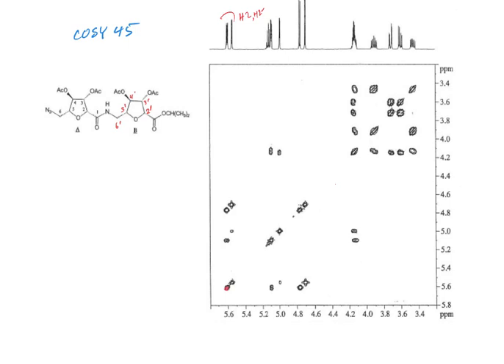Let's go from this most downfield one. Let's see here, what do we have? Oh, 3, 2, 2, 3. Yeah, that's not actually correct. So the thing we didn't consider, last time, instead of having those acetates on there, they were just alcohols on that other one.